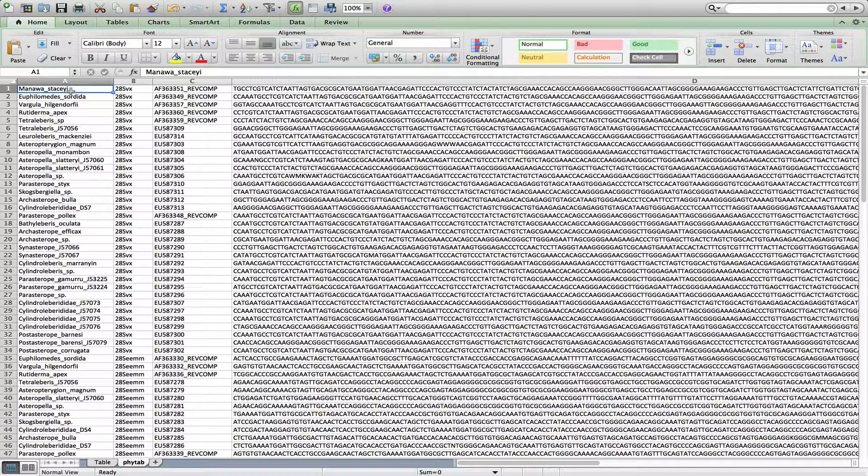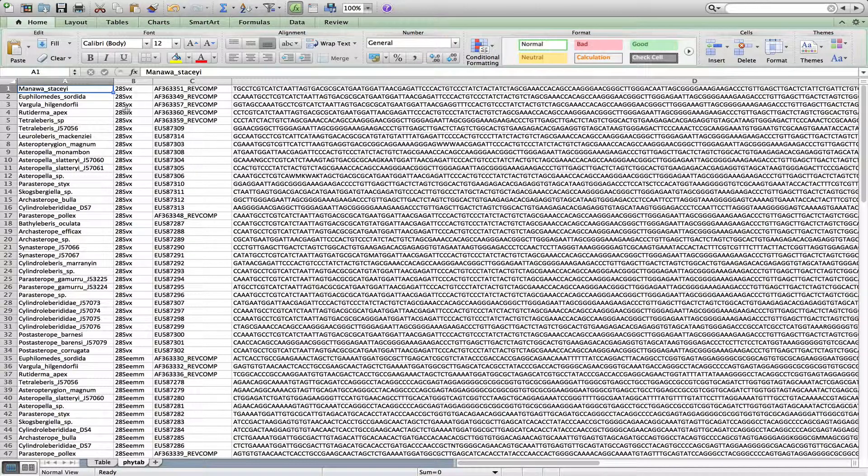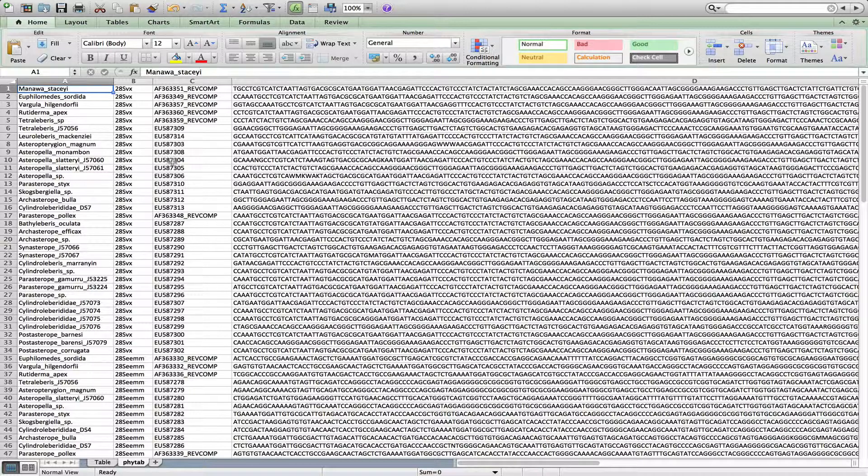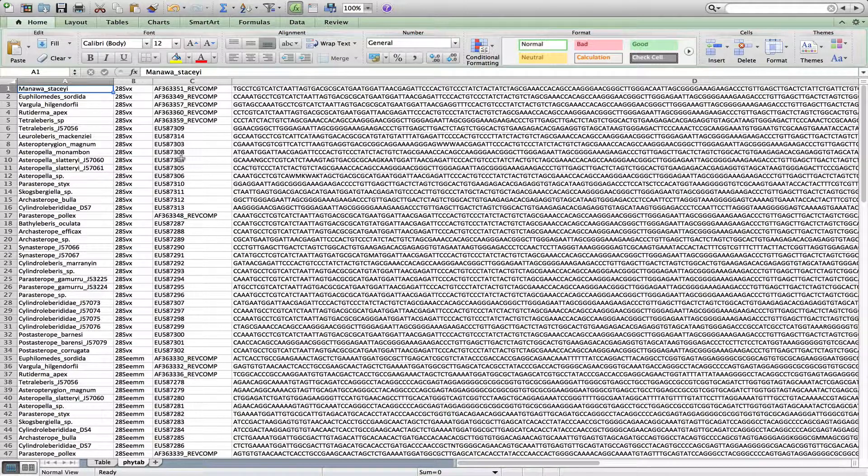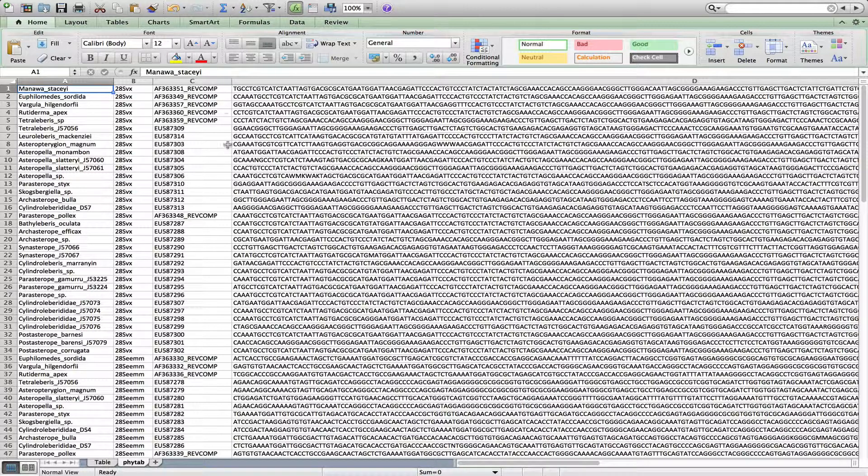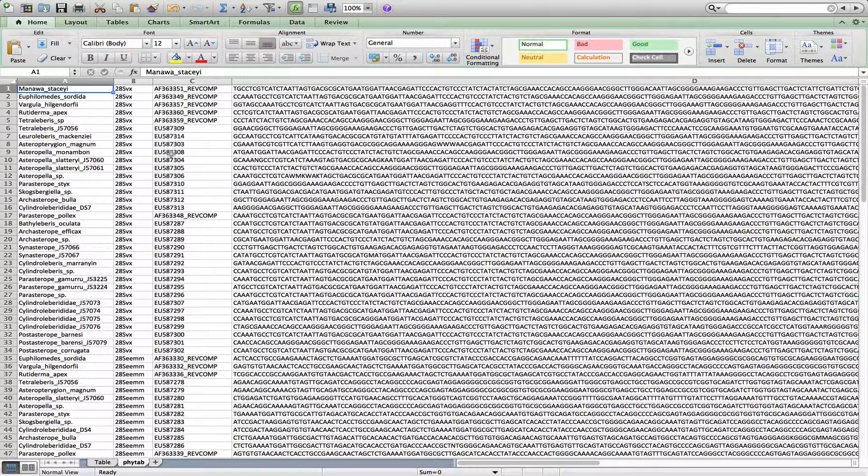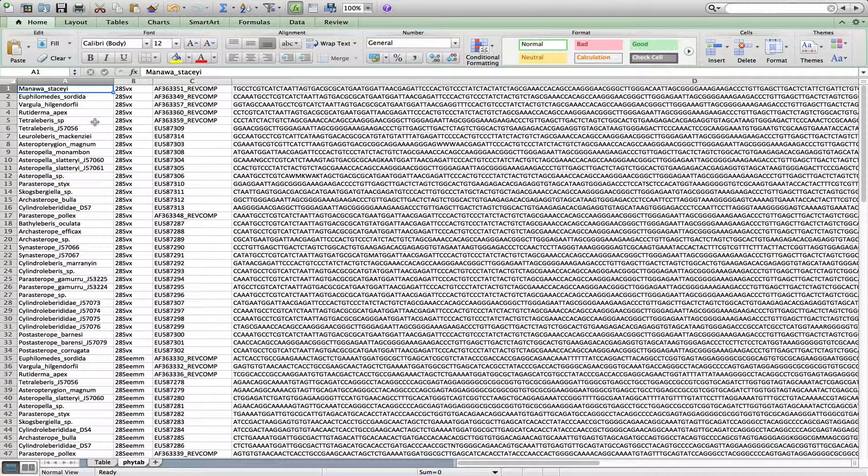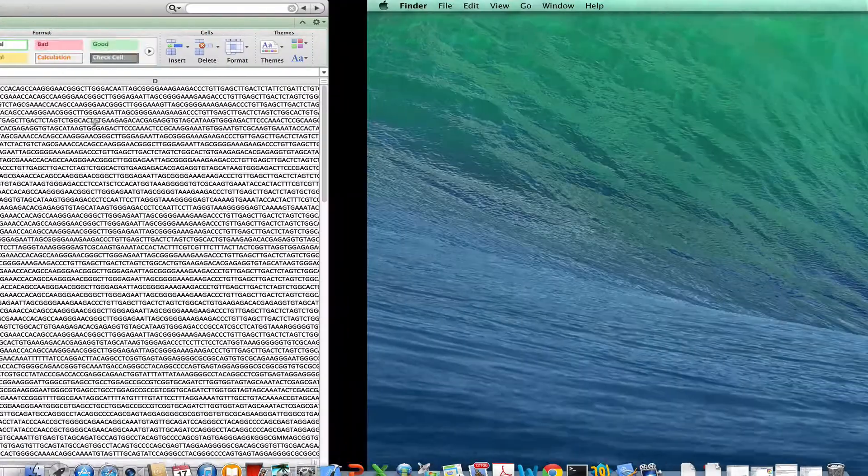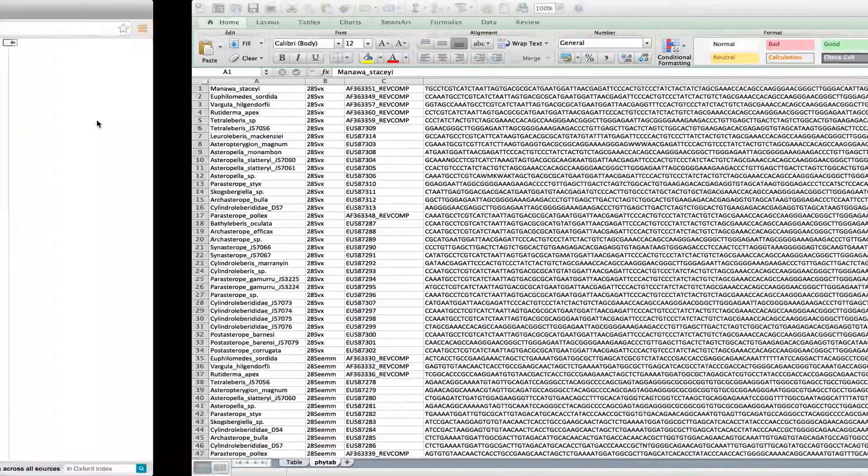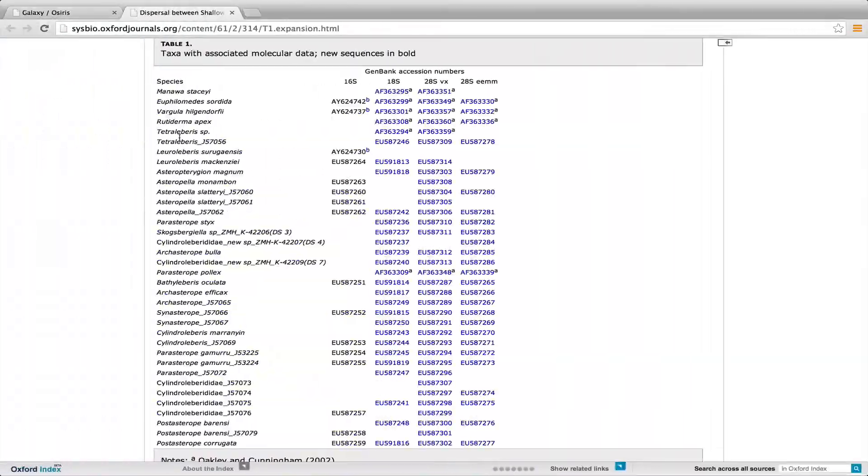So the first column is the species name. Second column is the gene name. Third column is the unique accession number for each gene. And the fourth column is the sequence. So these can be DNA sequences, as in this case, or they can be protein sequences.